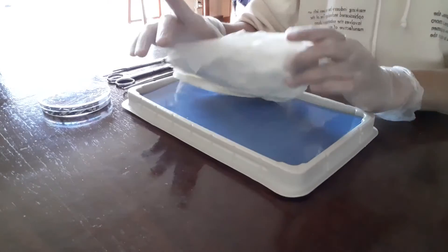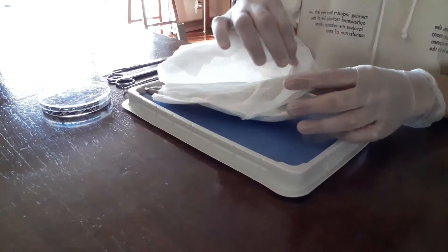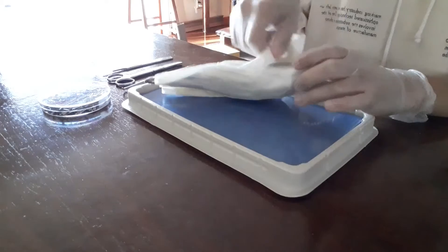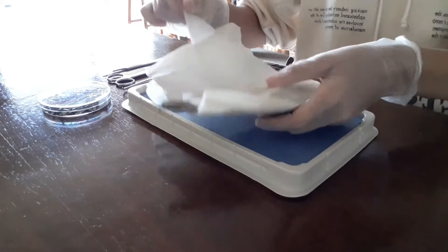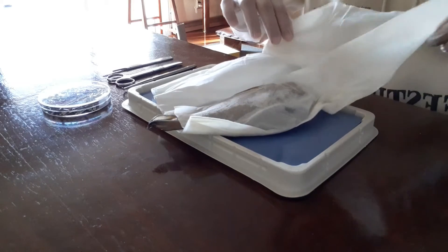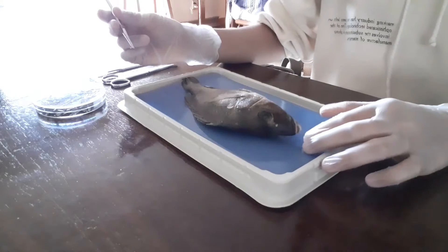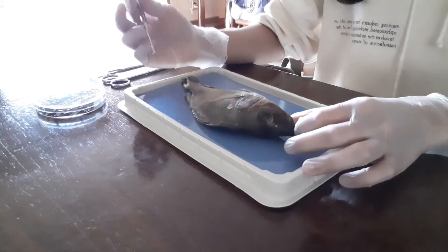We have our specimen right here and we're going to be looking at the outside body parts. Let me unwrap this real quickly and we can reveal the specimen. Here's our specimen right here and we're going to be labeling the outside body parts that it has.